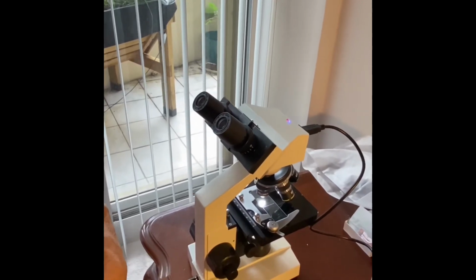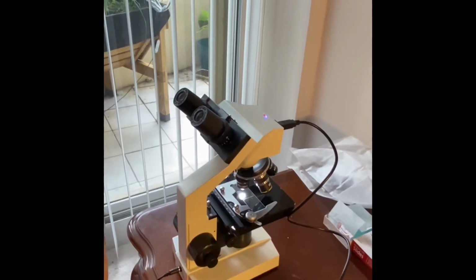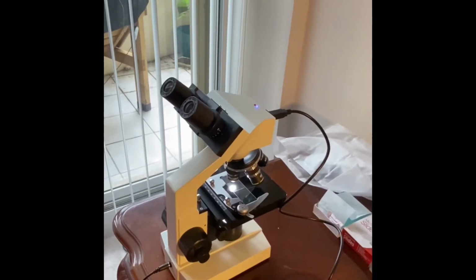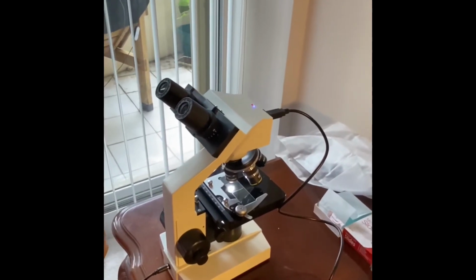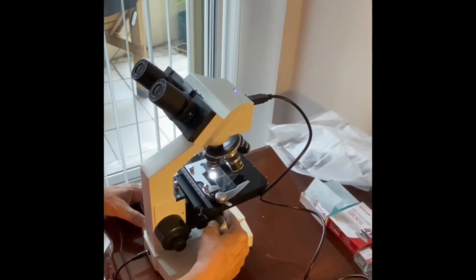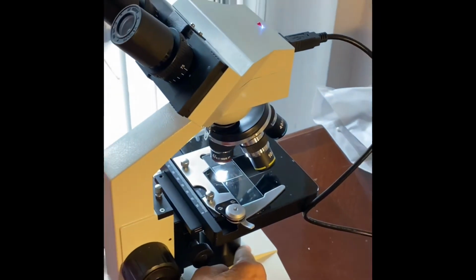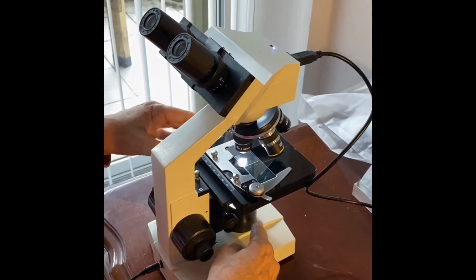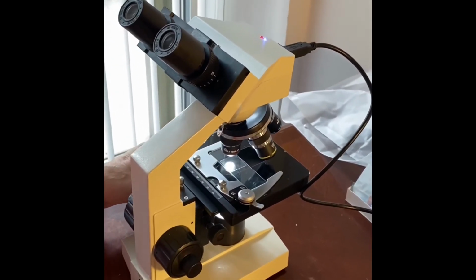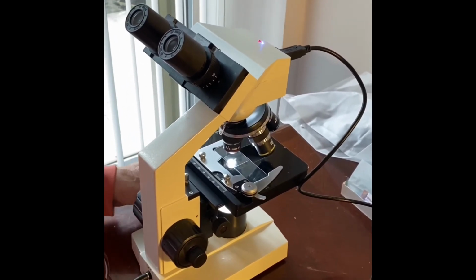So basically, we have gone over just about 5 or 6 parts which are common to all microscopes. Let's start again with the light, which is down at the bottom. Then upward to the mechanical stage, which you can move up and down and to the side.